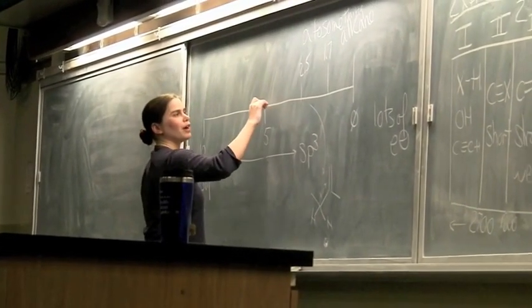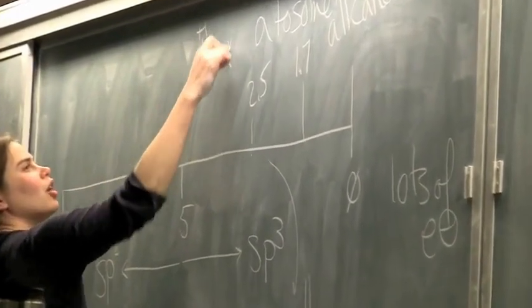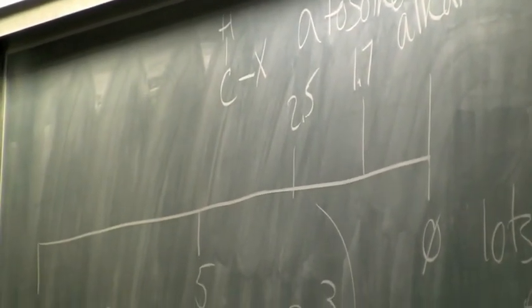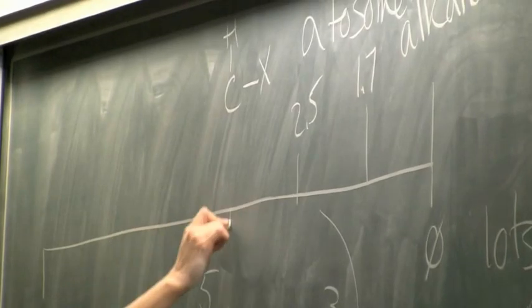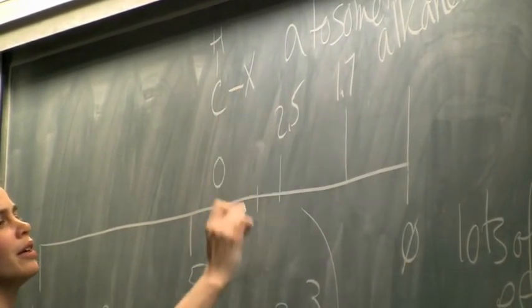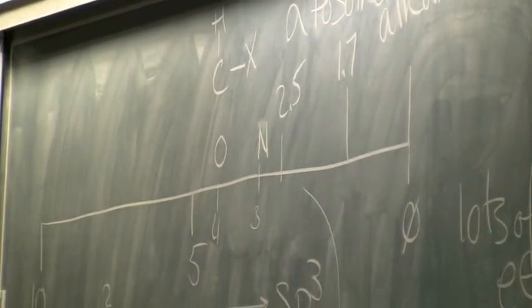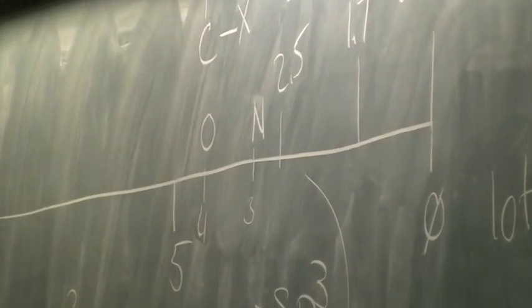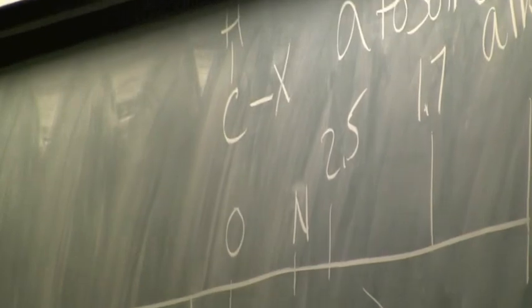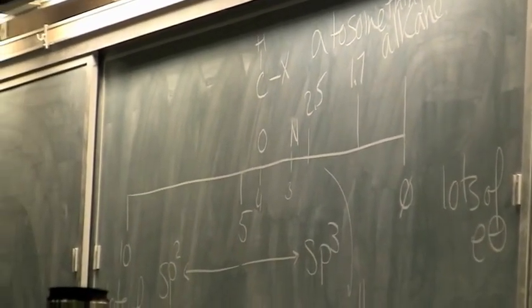We go from about 2.5 to 5, and this is CH, some sort of heteroatom. The more electronegative that heteroatom is, the more to the left. Oxygen tends to hang out near 4, nitrogen's closer to 3, halogens are somewhere in the middle. Chlorine's more nearby oxygen, bromine's more near nitrogen, iodine's actually kind of up in that 2 to 2.5 range again. So we're looking at just sort of how electronegative is it.